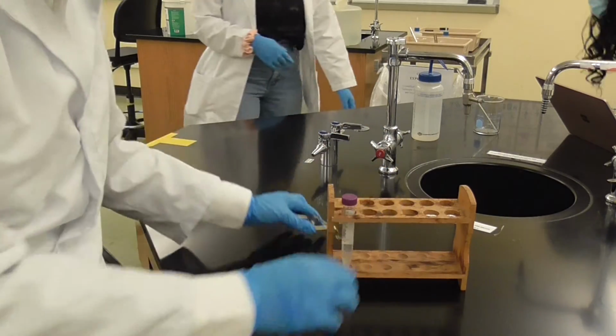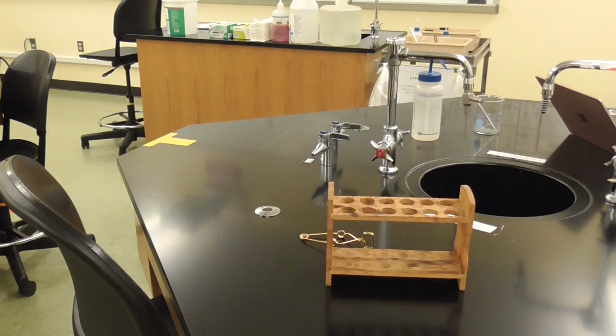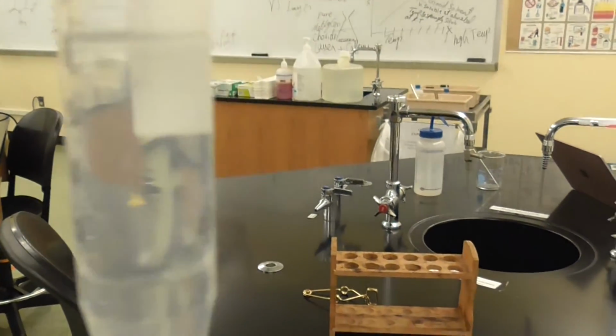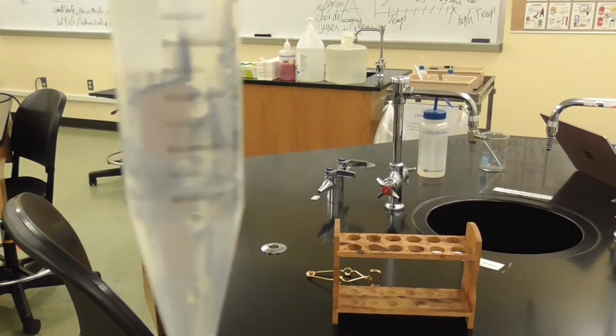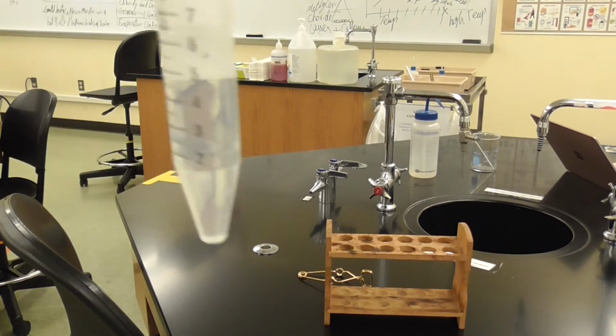So after shaking, you're going to let it sit so that the 2 layers can form. So these are the 2 layers. As you can see, we did add 2 milliliters of the methylene chloride to our mixture of water and caffeine, and we were able to see 2 layers.